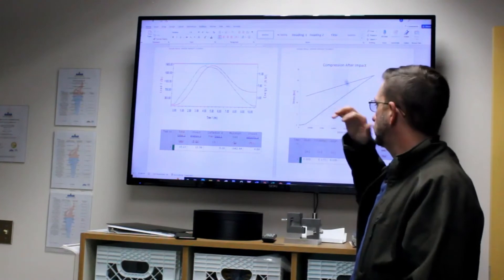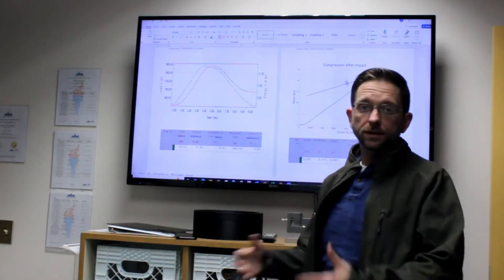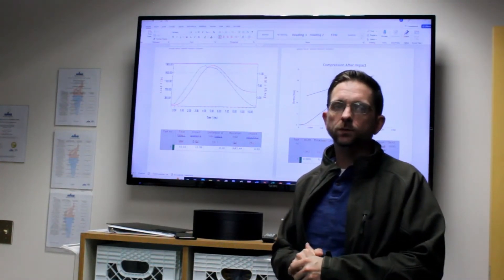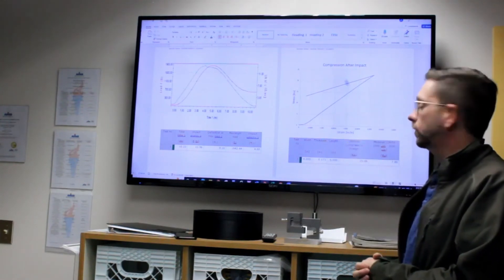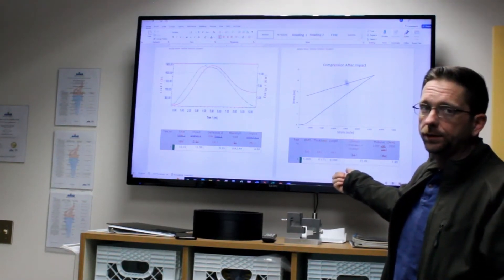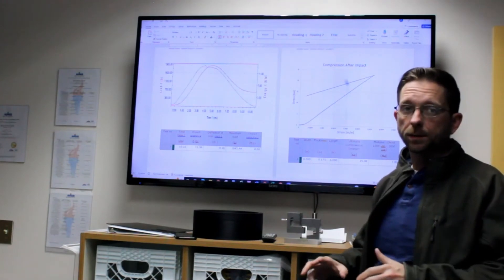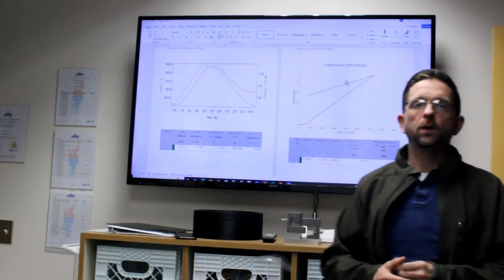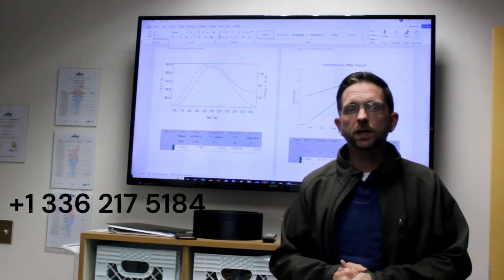We use this information to provide maximum load and deflection at the center of the impact, and present that information to the customer along with the dent depth found post-impact and damage characteristic information. Then we perform the compression after impact test. This shows the type of graphical results we would present: modulus information and the ultimate stress of the material. We would also indicate whether we experienced any bending or buckling to verify that it was an acceptable test according to the ASTM. If you or anyone you know might require this sort of testing, please let us know — our phone number is 336-217-5184.